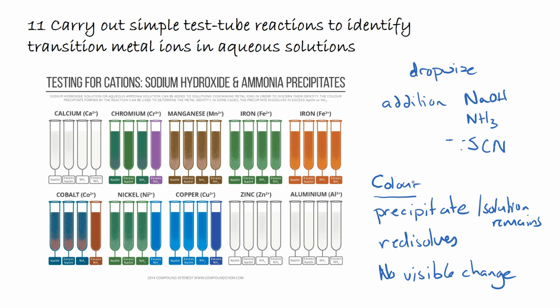The only final thing is just to point out that we have the dropwise addition, and once we've added dropwise, we may then go on further, add more sodium hydroxide or ammonia, and the way that we describe this addition of more solution is to add to excess of sodium hydroxide or ammonia.